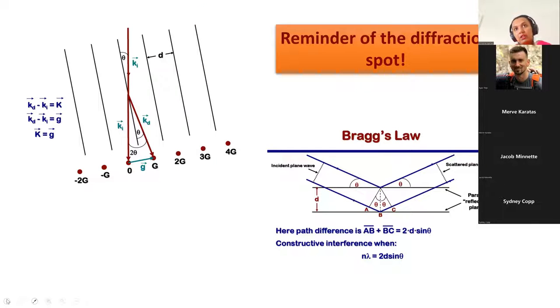Here is again the recall, because I would be talking in detail about how the diffraction patterns are formed, and introducing you to the concept of zone axis. So we recall this, right? These are your planes here, and this is your transmitted light, which is your transmitted electrons. And you know that this would be the brightest spot in your diffraction pattern because most of the light is passing through it. Now, the spots on the sides definitely contain the information about D.